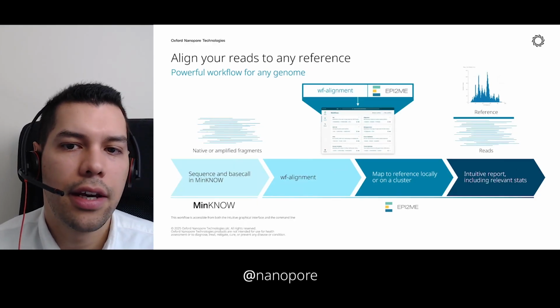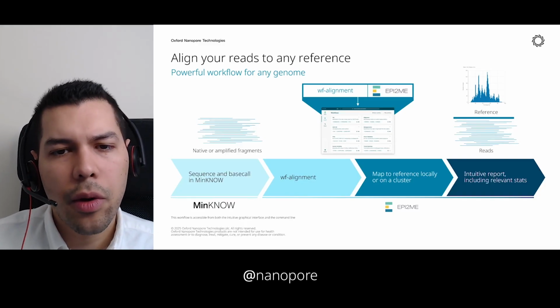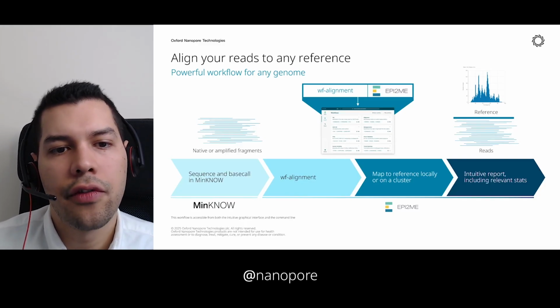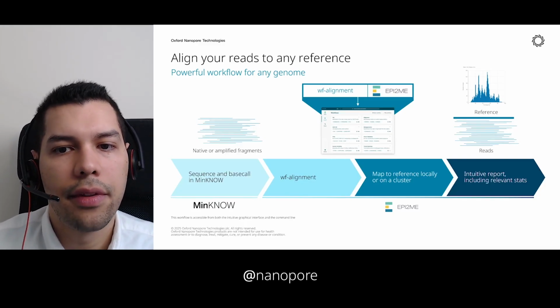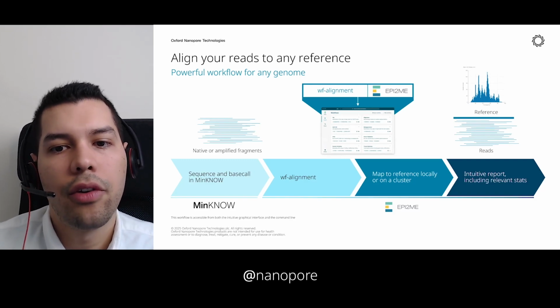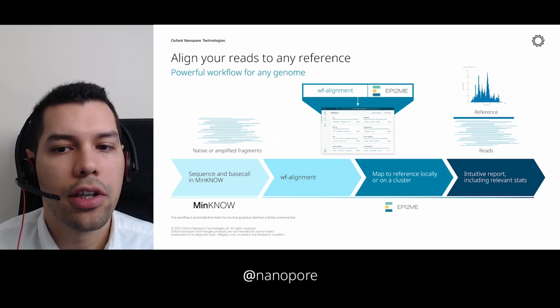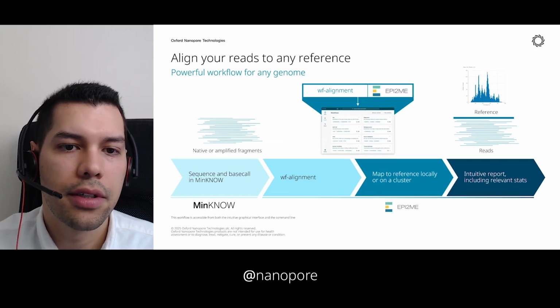After you've base called your data, you can use our flexible standalone alignment workflow to align it to a reference of your choosing. The workflow uses Minimap2, which is a versatile sequencing alignment program that will align the input reads to the reference provided. The workflow will output the fully aligned reads in a BAM file format, as well as a QC report summarizing the results.